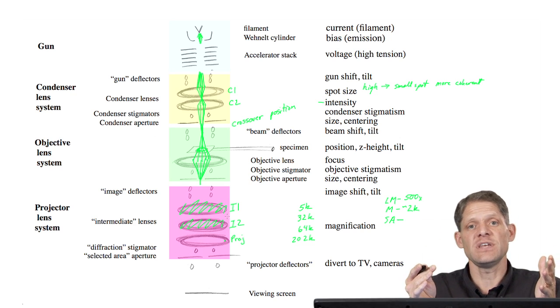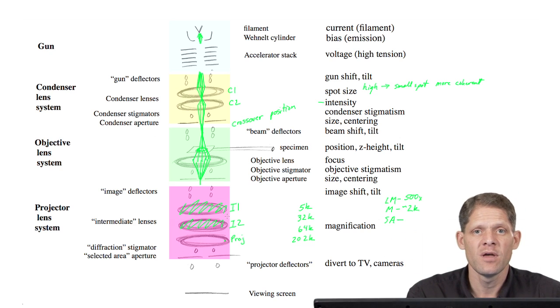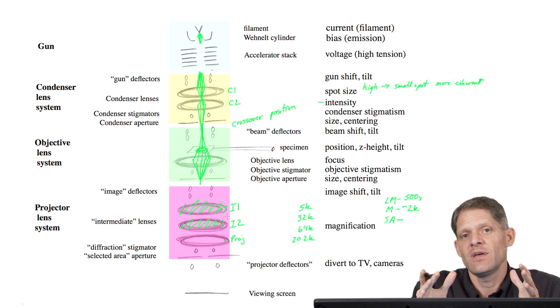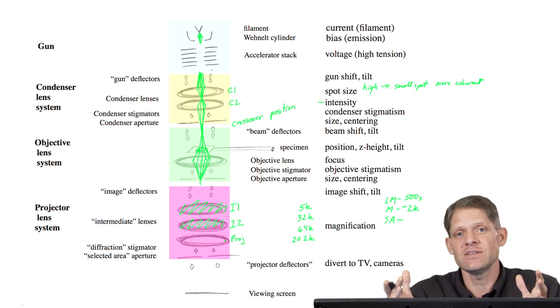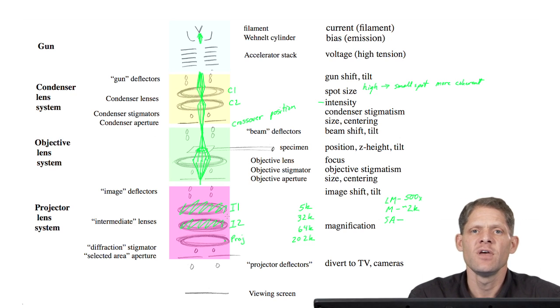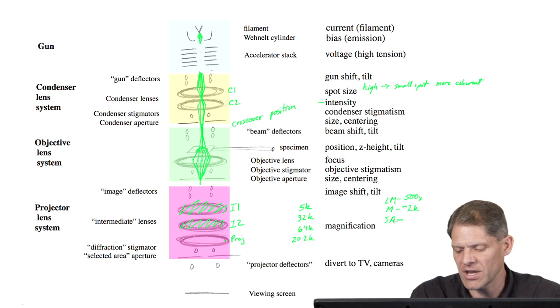They stop producing heat. The cooling water is still passing through the microscope, and so the whole microscope may cool down a little bit. This will change the resistivities of all of the coils and change the magnetic field somewhat. So you'll find that your microscope is more stable if you can stay in the same range.